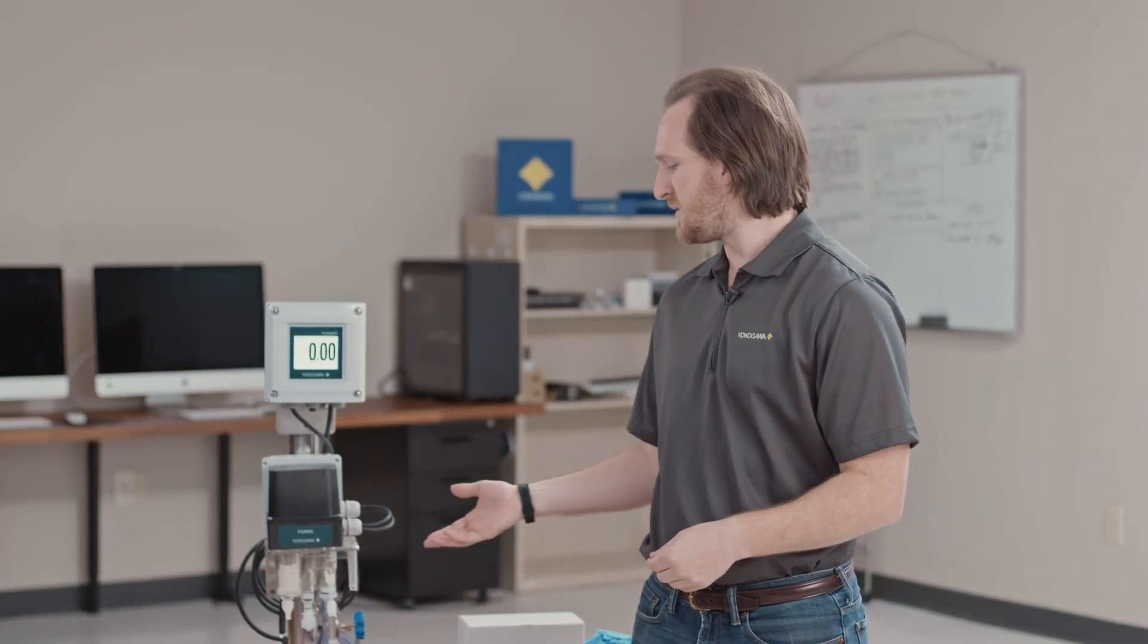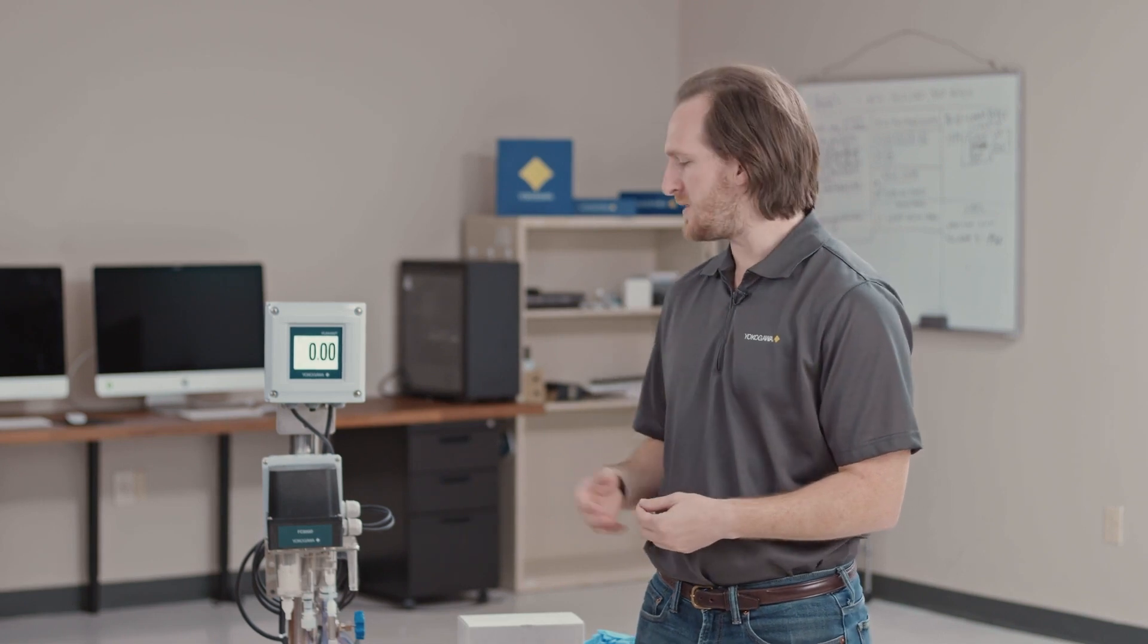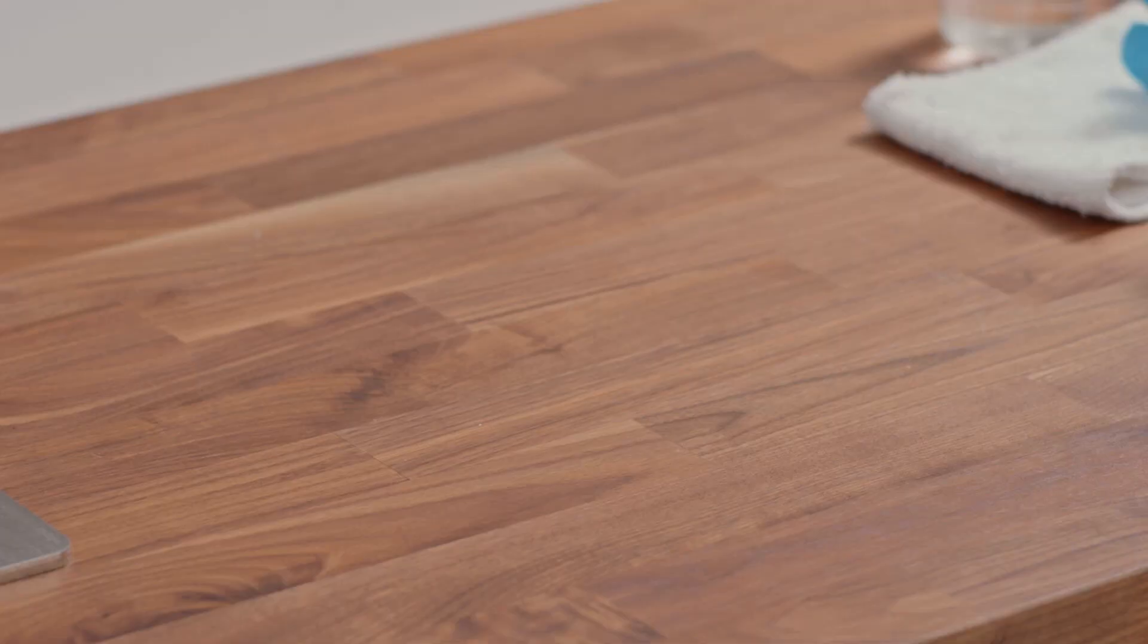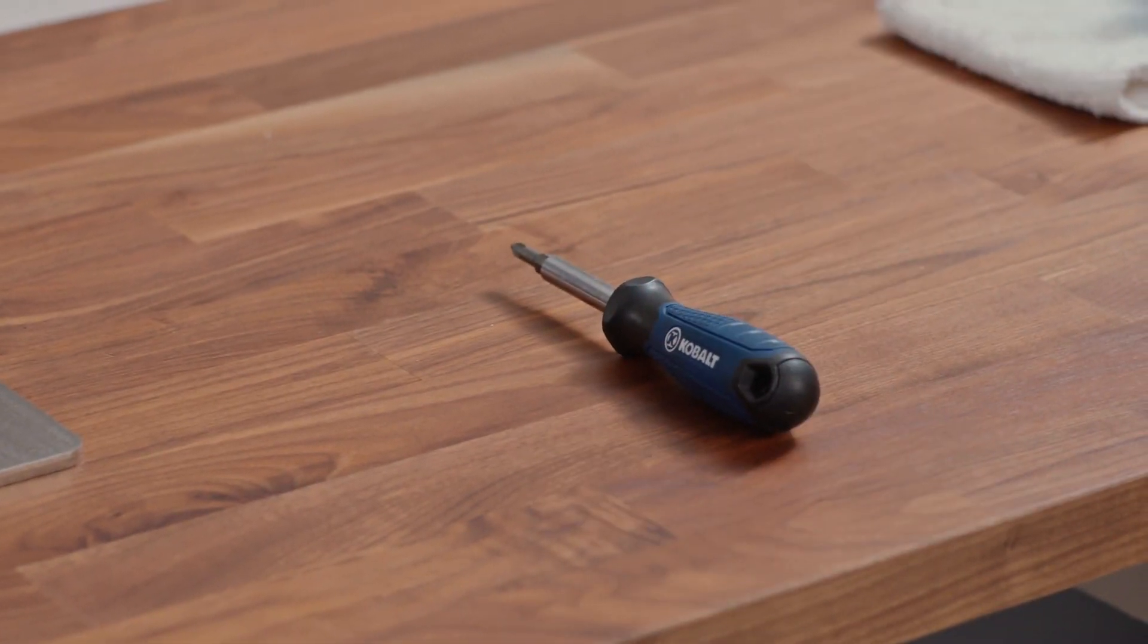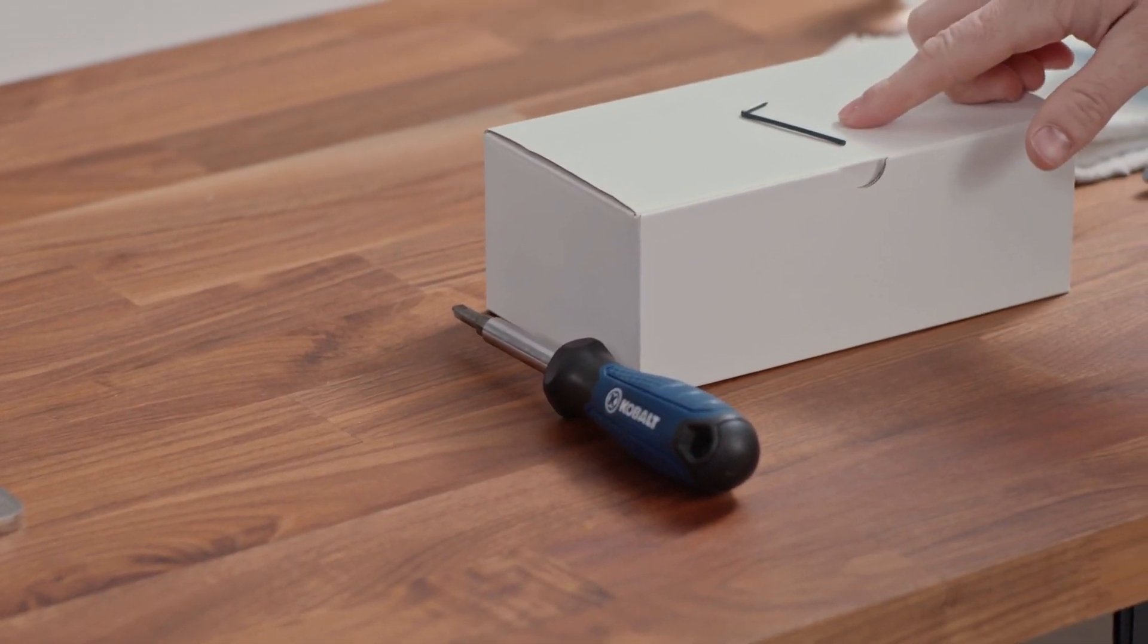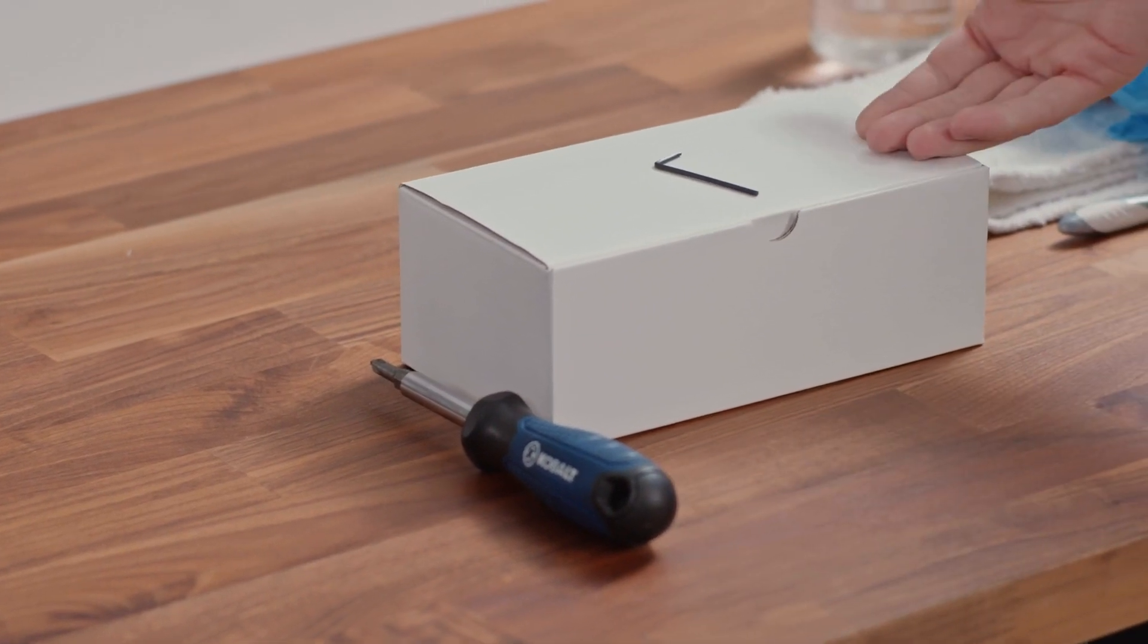The next maintenance item we'll cover today is how to change your measurement electrode as well as polish and maintain it. To change the measurement electrode, you will need a Phillips head screwdriver as well as the two millimeter Allen key that was included with your FC-800D.